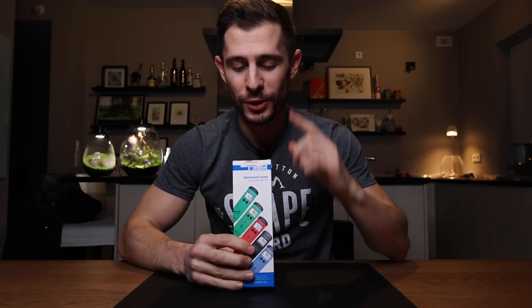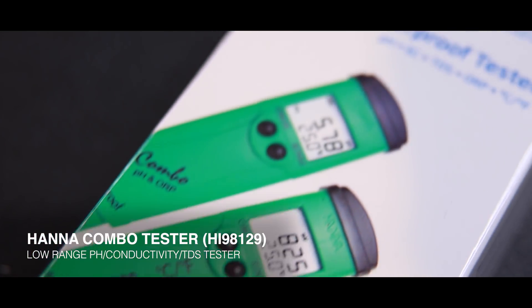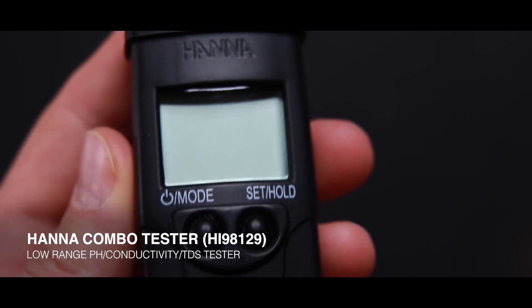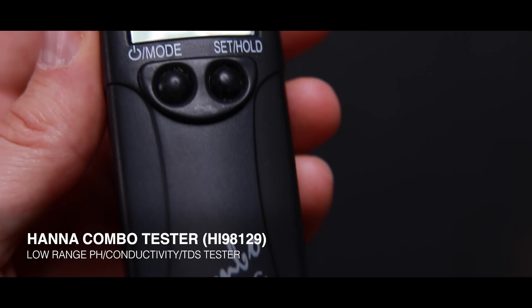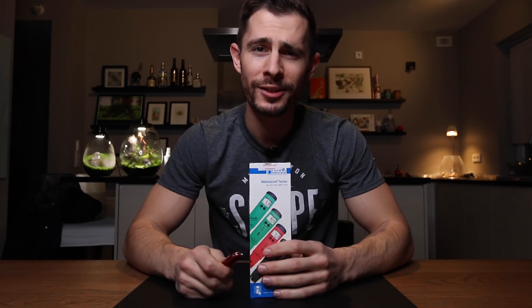Hey, what's up guys! My name is Joris and in today's video we're going to unbox and calibrate this HANA combi tester. This little device is capable of measuring pH, TDS, conductivity, ORP and temperature all in one single device. It's freaking awesome because those are the main and most important parameters I need on a daily basis. So without any further ado, let's take out my huge Swiss army knife and get right into it.